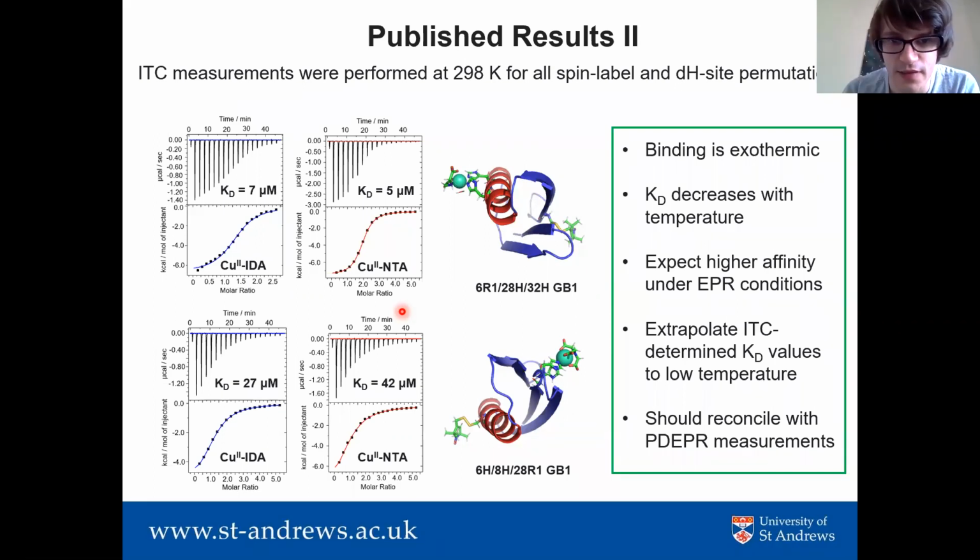No, I think you are completely right, and that is a problem with this approach. You are right that your label would probably fall off. So really, the spin labeling is the last thing that we do, and I can't really comment on how effectively it sticks around if you label prior to, for example, needing to do additional purifications.